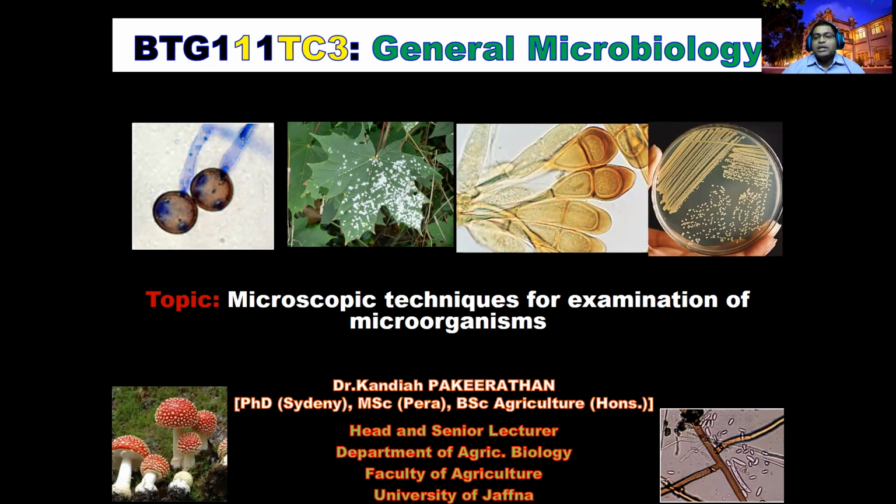In the general microbiology class, today we are going to discuss in detail the microscopic techniques for examination of microorganisms. Last class we were discussing the different types of microscopes and how you can measure the microorganisms using different types of microscopes.